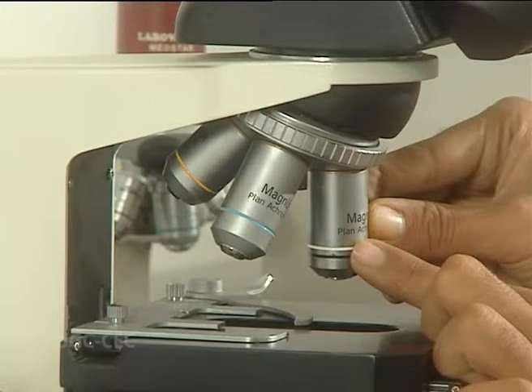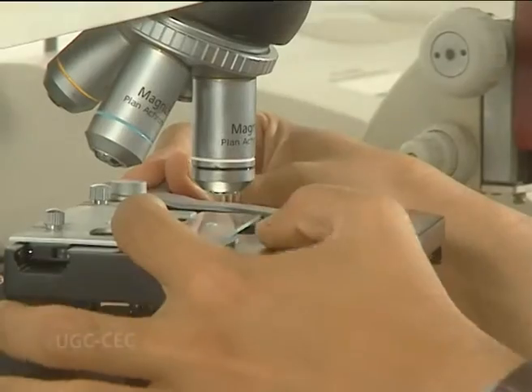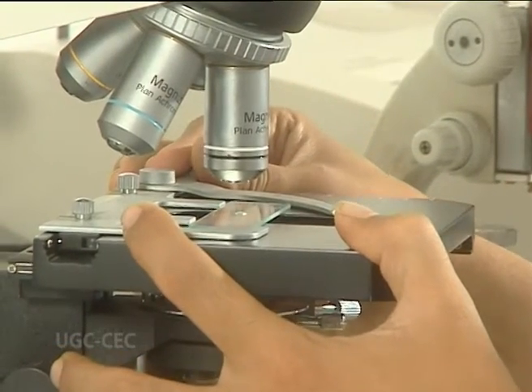That is, for 10x it equals 0.25, for 40x it equals 0.65, and similarly for 100x it is 1.25. A high numerical aperture indicates a high resolving power and thus useful magnification. To provide the best image at high magnification, immersion oil is placed between the slide and the oil immersion objective, especially only in 100x.